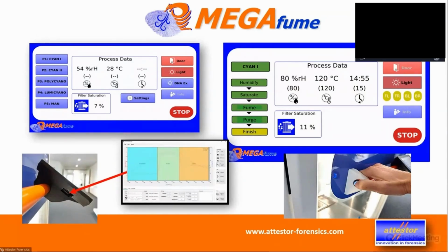Most of our customers do not actually do that with every cycle, but they leave the information on there, probably pull it off once a month or so and put it onto their quality data server. And in case the law court has questions or an auditor wants to know how do you record your quality data, this is the way they do it. They don't have to do anything. The system is just doing it automatically. And if you don't utilize this data, forget about it. It's still there. That much about the data logger.